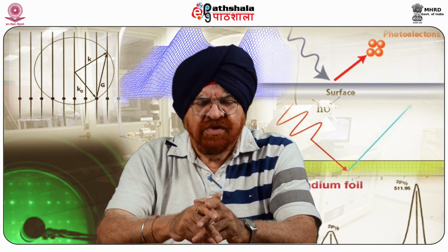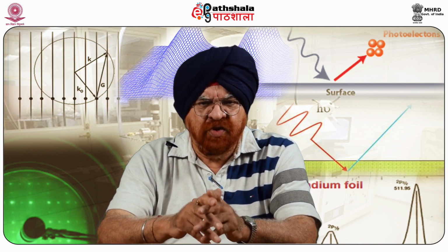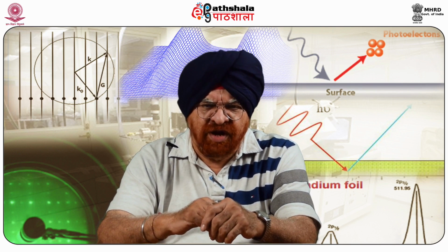For example, fracturing, cutting, or scraping in air or ultra high vacuum to expose the bulk chemistry, ion beam etching to clean off some of the surface contamination, and exposure to heat to study the changes due to heating, exposure to reactive gases or solutions, exposure to ion beam implant, or exposure to ultraviolet light would result in the moving out of an electron, which can be analyzed in terms of how much energy is needed to knock off that electron.